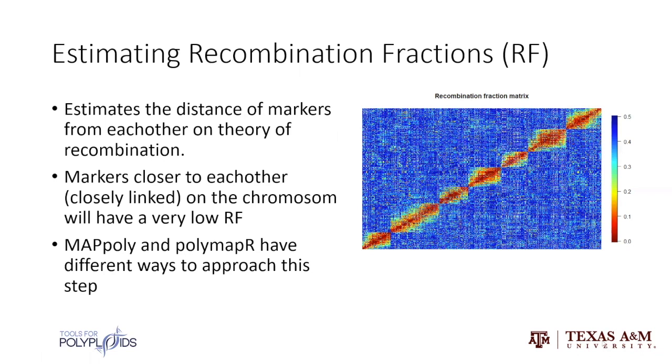All right. So what you see here are 7 linkage groups, 2 being really long. And then you'll see a pattern of just red through the middle, which is what you want to see. Now, on really bad data sets, you won't see red in the middle.